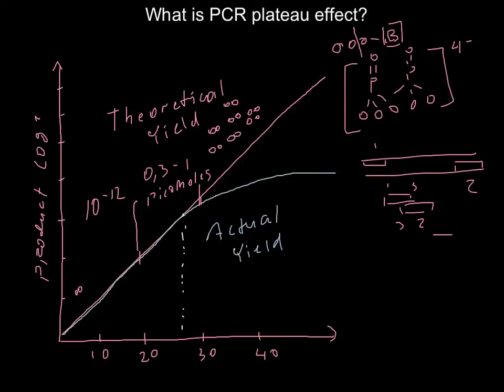Primer dimers come in two types. When primer one and primer two bind together, this is called a hetero primer dimer. Alternatively, a single primer of 20 to 30 nucleotides may be self-complementary and fold back on itself. Primers can also anneal to non-specific locations they were not designed to target.